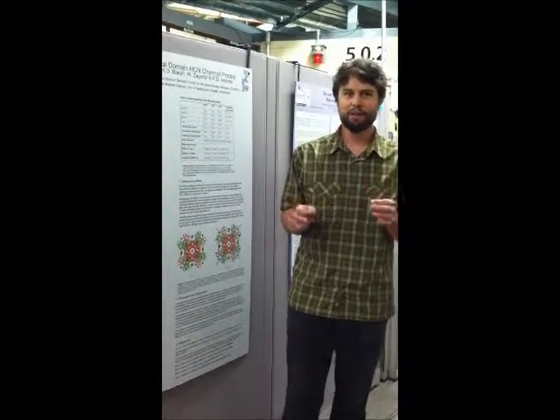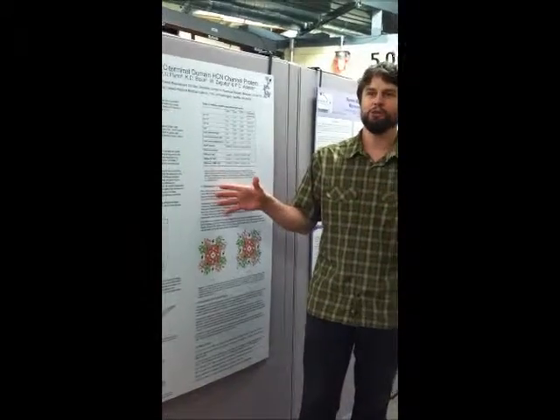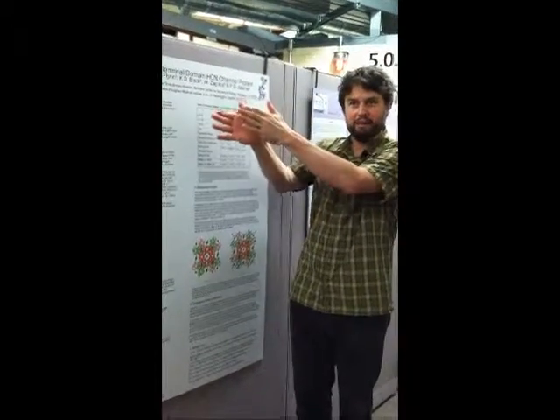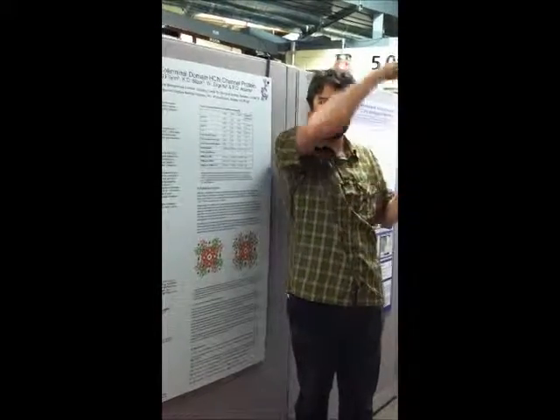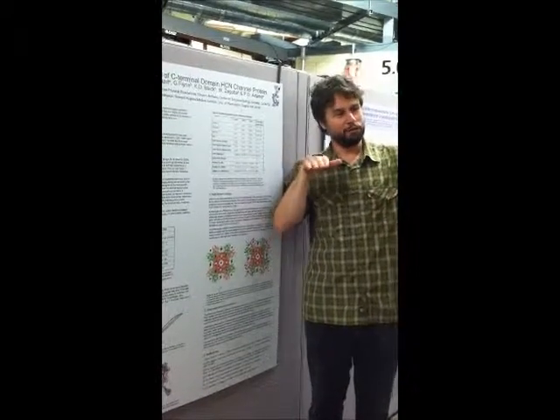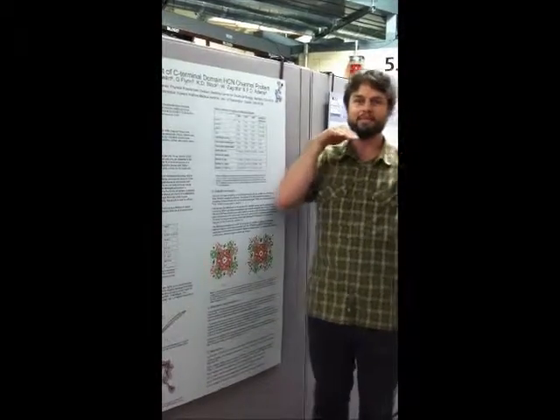And for those of you who haven't thought too much about crystallography, here's a simple analogy. You know when you're driving by an orchard in your car, and you get that really cool optical effect, right? Lines, and then a narrower spacing and a narrower spacing at the angles. Well, you might imagine if you measured all those spacings, you could calculate where all the trees were to give you that visual, right? It's exactly what they're doing here, except instead of keeping the orchard still and driving by it, they're standing still and turning the orchard around and taking snapshots.